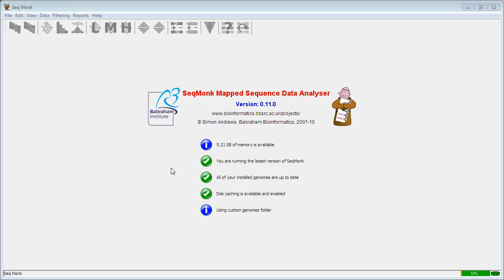We're going to look next at how to start a new project in SeaMonk. The basis for all SeaMonk projects is an assembled annotated genome, so the first thing we need to do is tell the program which version of which genome assembly we want to use for this project.